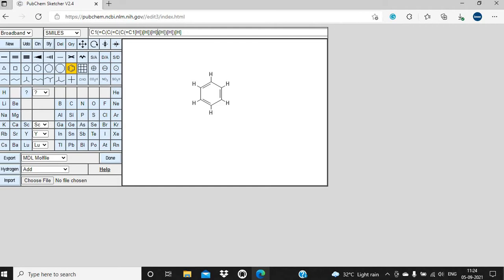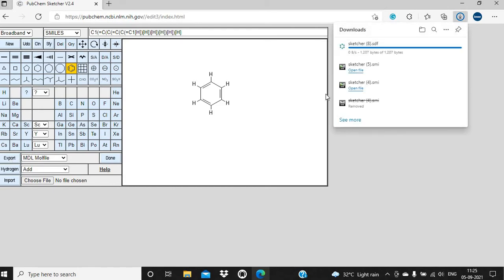This notation can be accepted by many molecular modeling programs, and we can use this SMILES notation to get the 3D structure of any small molecule. So if you want to export or save this structure, you can click on Export here. By default, the MDL mol file option is selected, so when you click on Export it will export in the SDF format, giving you a sketcher.sdf file.